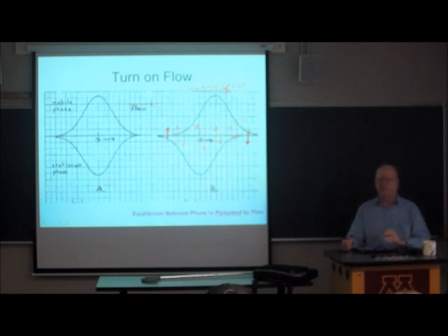Unfortunately, the axial motion is governed by convection, principally, whereas the radial motion is principally governed by diffusion. And diffusional processes tend to be slow. Convection can be slow or fast, depending upon how much flow you apply, how much pressure you apply to the fluid to push it through the column. But once the transverse transport becomes slow compared to the axial transport rate, you're going to get peak broadening.